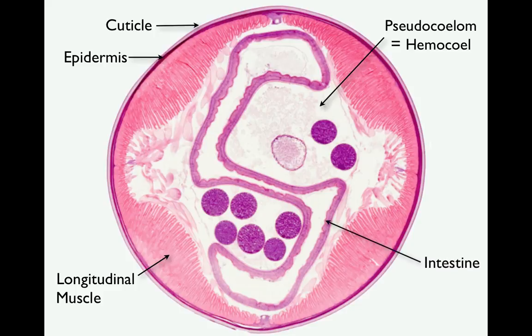The large S-shaped structure that you can see here is the intestine. Unlike the planaria that you may have looked at earlier, Ascaris and other roundworms have a complete digestive system, with a mouth at one end and an anus at the other. This is considered to be more efficient for digesting food and eliminating waste than a gastrovascular cavity.